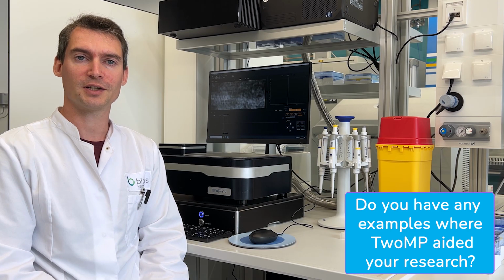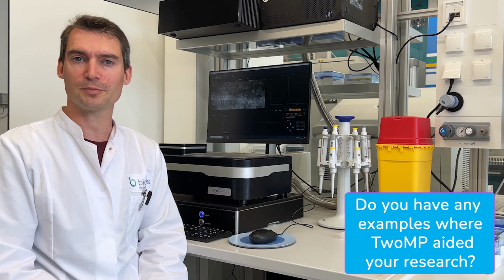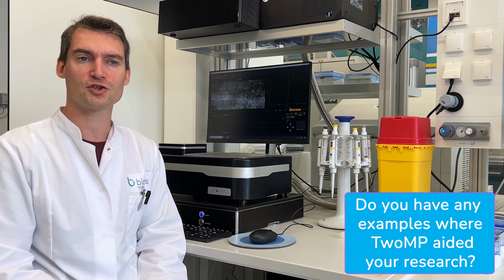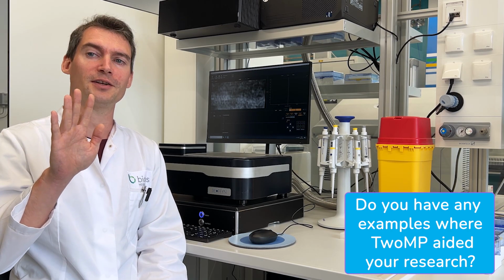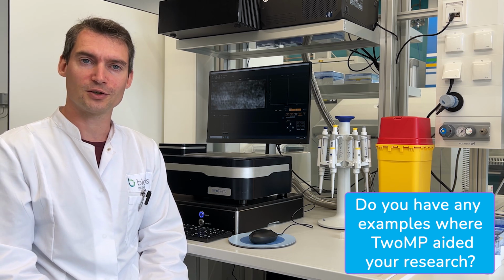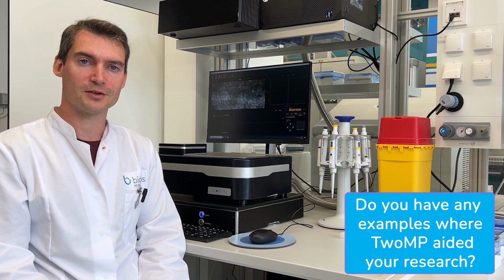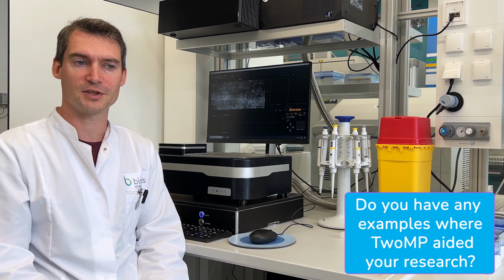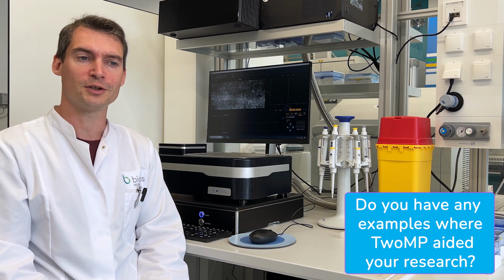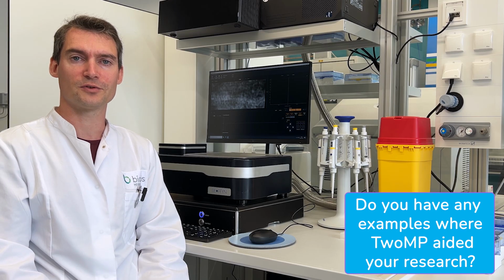But the second peak, in truth, wasn't a single peak, but a rare incident where multiple peaks just perfectly aligned with each other, basically like the fingers of a hand, that you could draw an entire Gaussian curve over all of them together and get a homogeneous peak back out of it. So if I had only the size exclusion at hand, I would have expected this peak to be perfectly fine and pure. And in our case, we knew that this would not be of any use in structure determination.